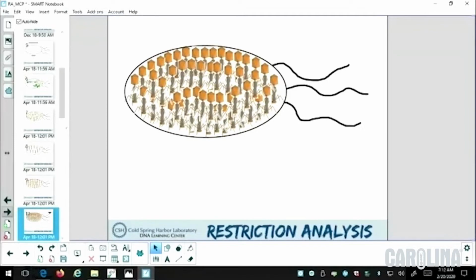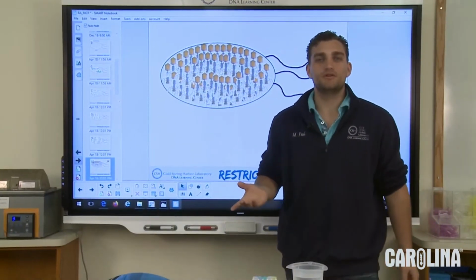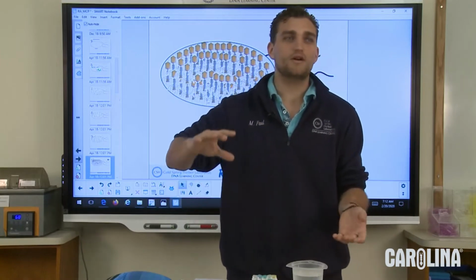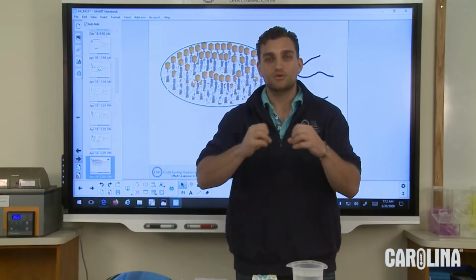And then I always like to ask this question: what happens when you put too much water in a balloon? What do you think happens? You take a balloon and you just keep putting water in there. What's going to happen? Exactly, it'll explode, it'll burst out. So it's going to pop.